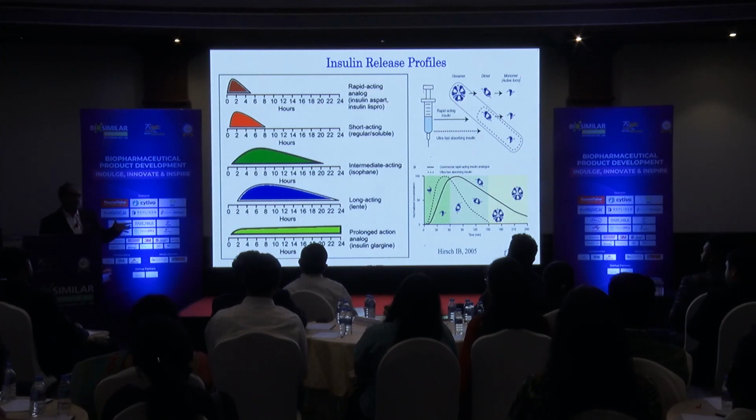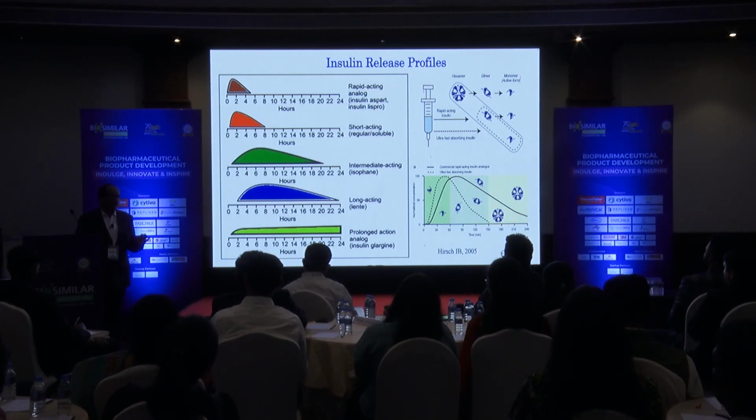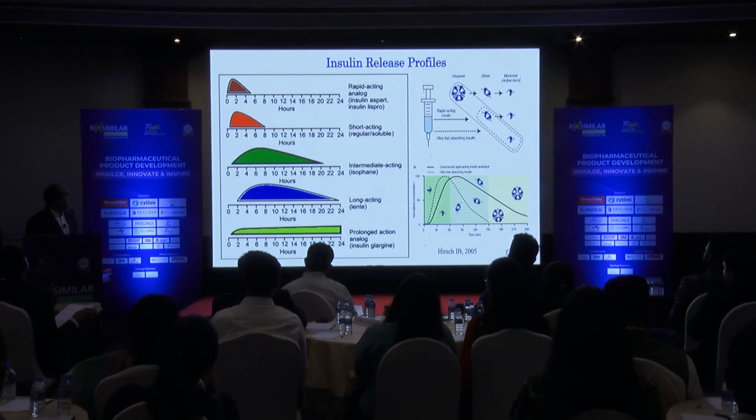Now hexamer is stabilized by using zinc and protamine sulfate, or it is microcrystallized for making this prolonged acting or long acting insulin. Now if you want to establish the higher order structural similarity, you have to go and characterize it in microcrystalline or biphasic state, and that's what we are doing in our lab.